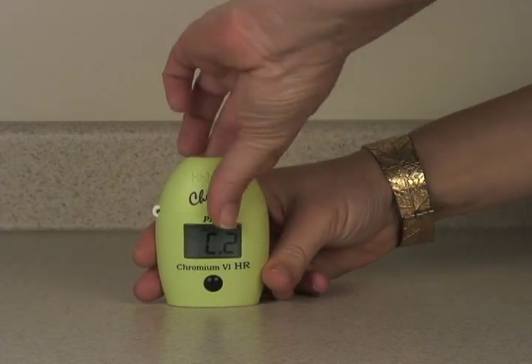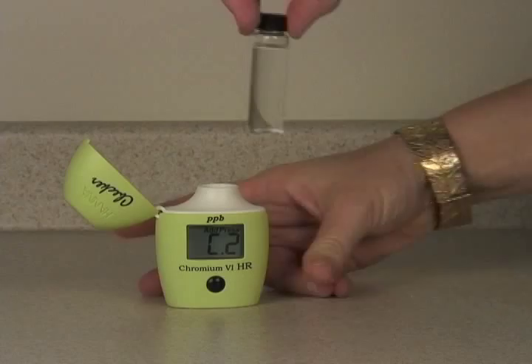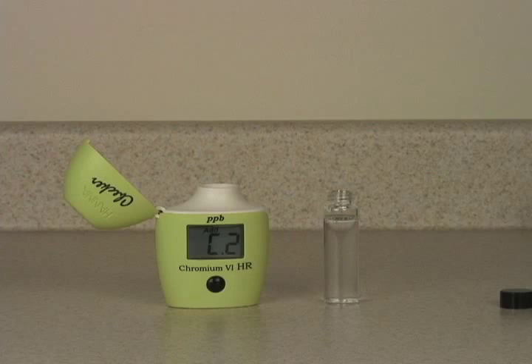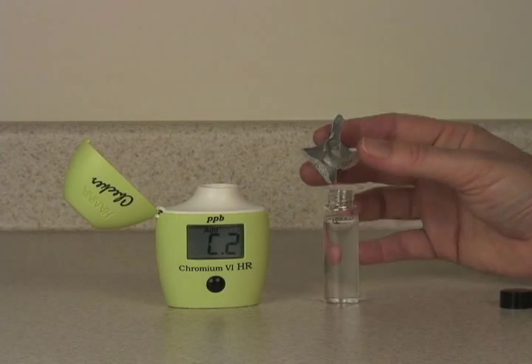When the meter displays C2, the sample is ready to be reacted. Remove the cap and add the reagent.